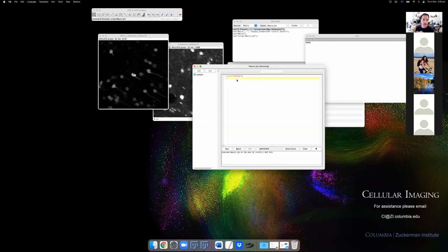The other things to very quickly go over are things like strings and integers. In any scripting that we do, we might not want to exactly type something in every time. And so we can assign a string, like a sentence or a word or a number, to a variable. Very briefly, if I wanted to assign hello to a variable like a, I could just say a equals hello. And I could put this just below. And if I run this now, we'll get the same result, but we're using a variable. This is very efficient because you can do different calculations and assign them to variables, and it can really shorten the amount of things you have to type in.